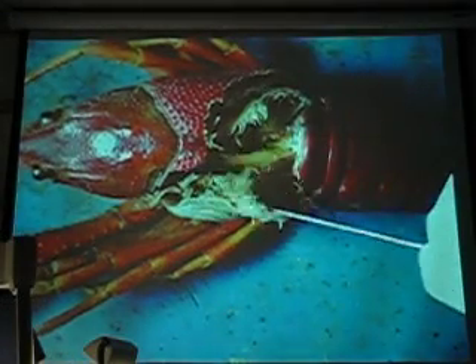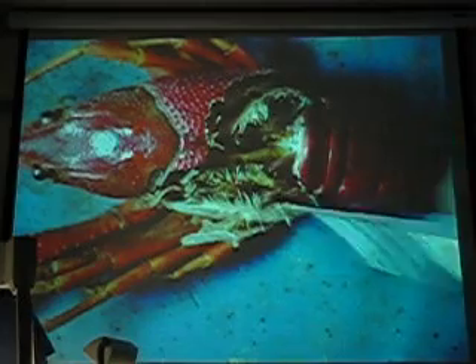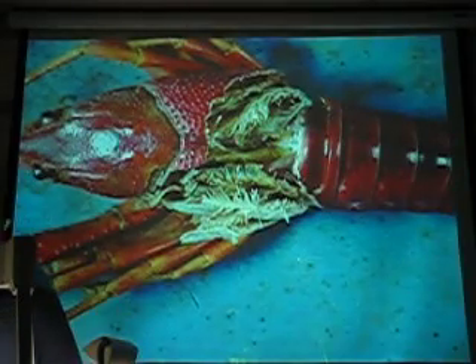Okay, here. Gills? Is it with the gills? Oh, I blocked the light. Here, I'll be sorry.